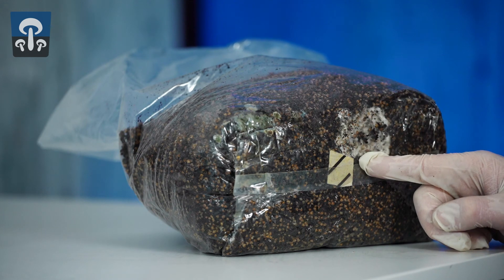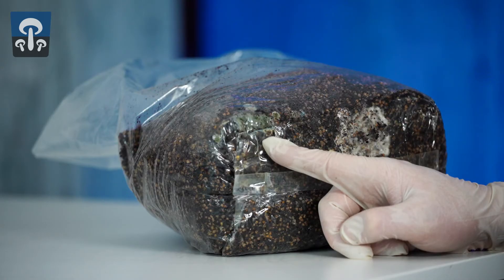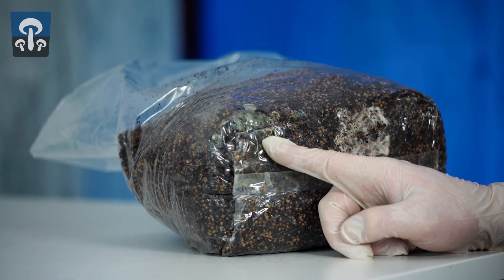On the right is the kind of mycelium you'd like to see growing in the bag from a mushroom species. On the left is a fungal mold spore from a contaminating species. If you see this, the bag should be thrown out immediately, with special care taken not to breathe in any of this mold or its spores, as doing so could be hazardous to your health.